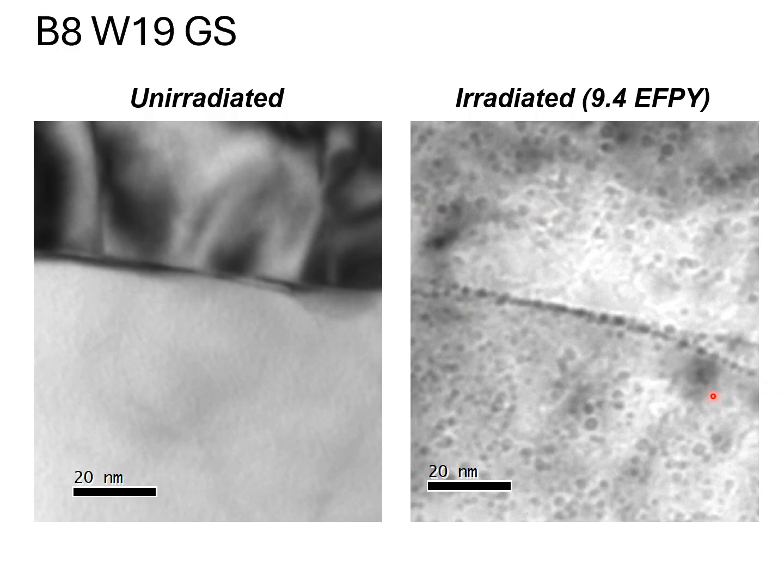And so I turned around and I said, oh, there you go. They are there. You just didn't have the microscope aligned. You have to spend the time to, and when I say align it, I don't mean just focus it. I mean align the objective, basically, just have a well-aligned image, and in particular the objective stigmators.